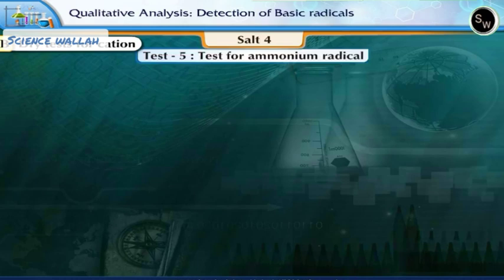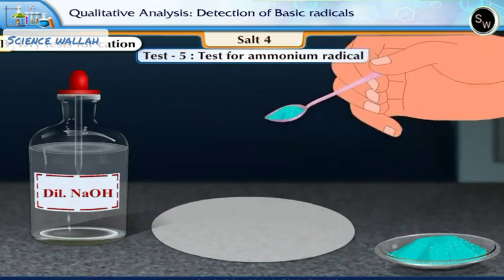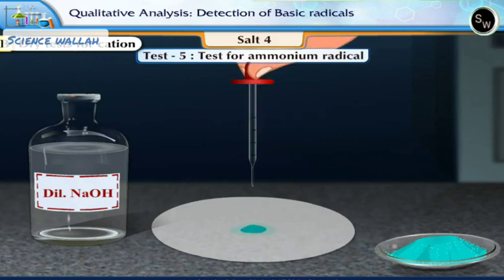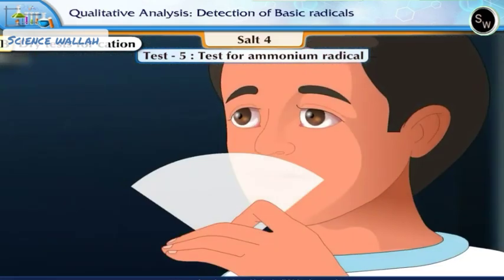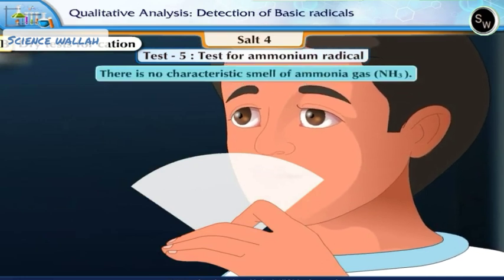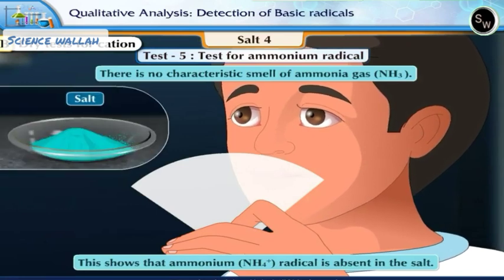Test 5: Test for Ammonium Radical. Take a pinch of the salt on a piece of filter paper. Add a few drops of dilute sodium hydroxide solution on it. Fold the paper and smell it gently. There is no characteristic smell of ammonia gas. This shows that ammonium radical is absent in the salt.